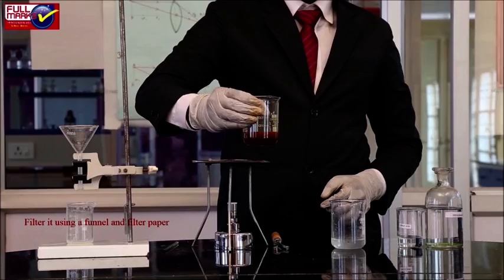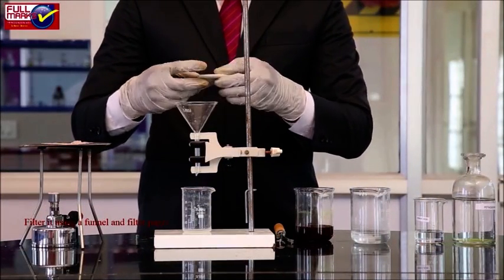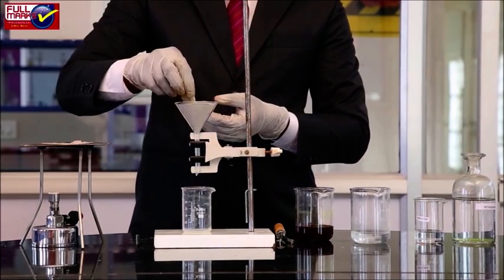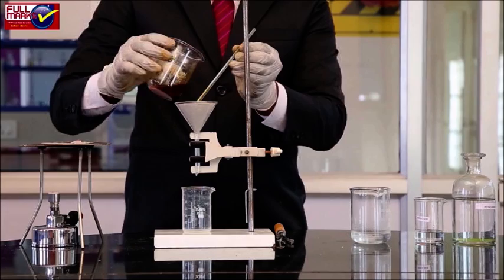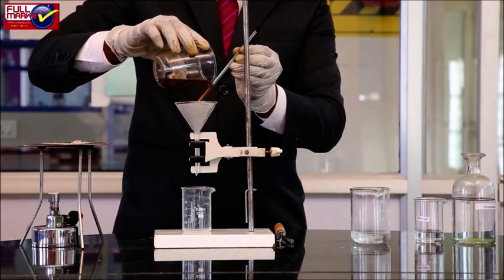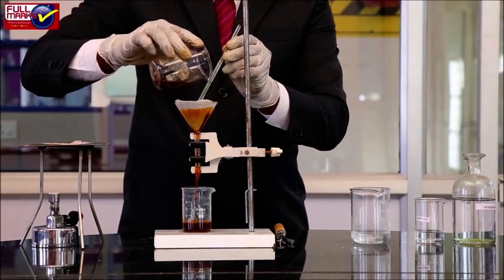Filter the precipitate using a funnel and filter paper. Wash the precipitate with distilled water.